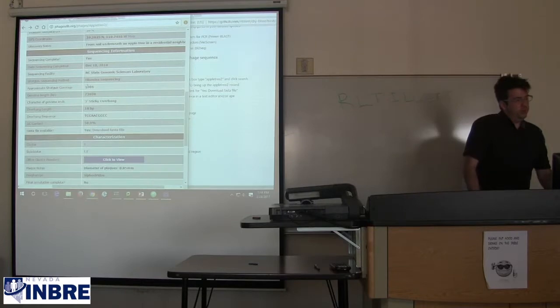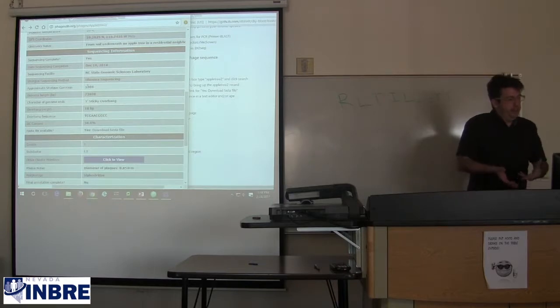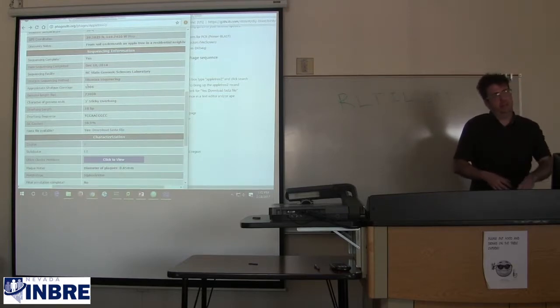And so the interesting thing about this Apple Tree 2, for the purposes of today, is one, it might be germane to what students are already learning, and also that it doesn't exist really outside of TMCC and outside of PhagesDB and the SEA-PHAGES project, which means NCBI does not yet have records based on Apple Tree 2.